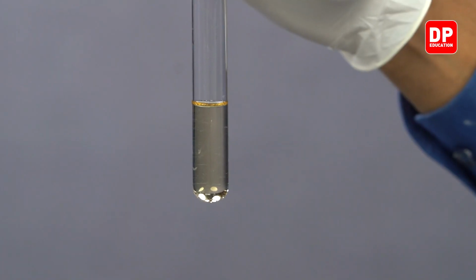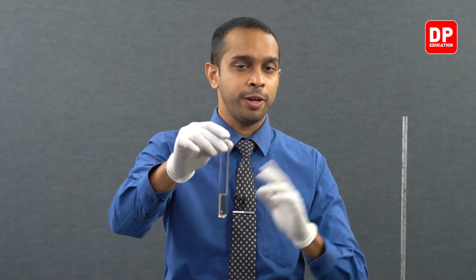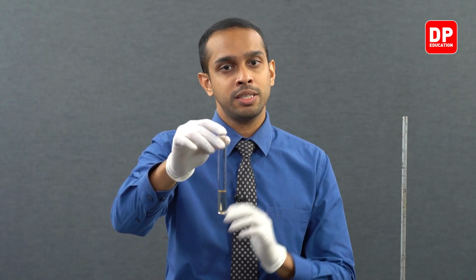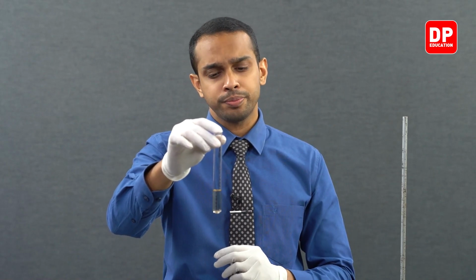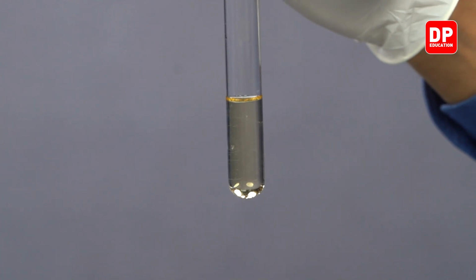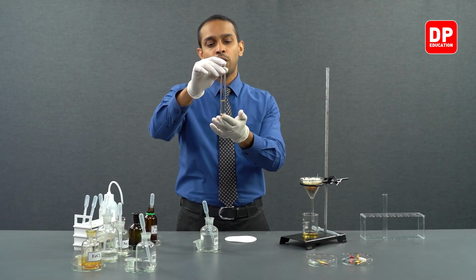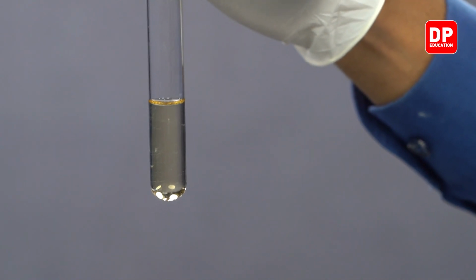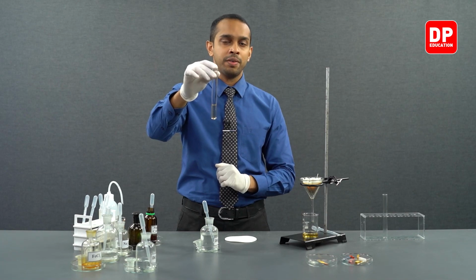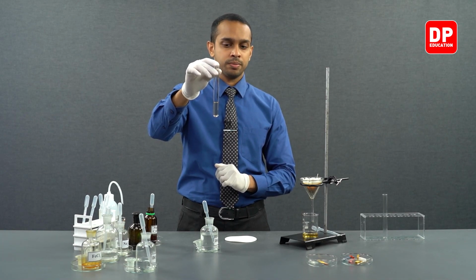Therefore, you break the complex that is formed between Fe3+ and phenoxide anion, because phenoxide anion will no longer be there. Instead, it will form phenol. So therefore, due to the absence of the Fe3+ and phenoxide anion complex, we do not observe the violet color. Instead, we have the yellow color that we observed in the previous Fe3+ neutral solution.